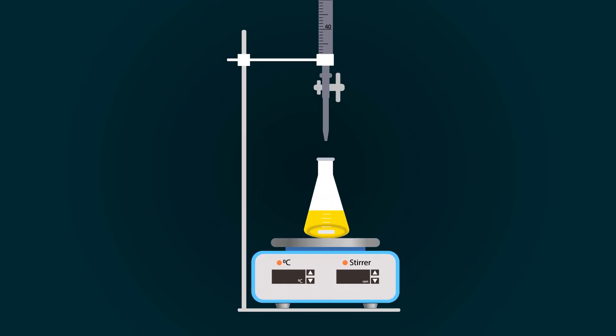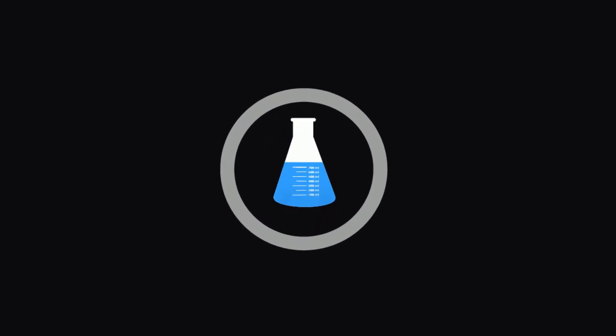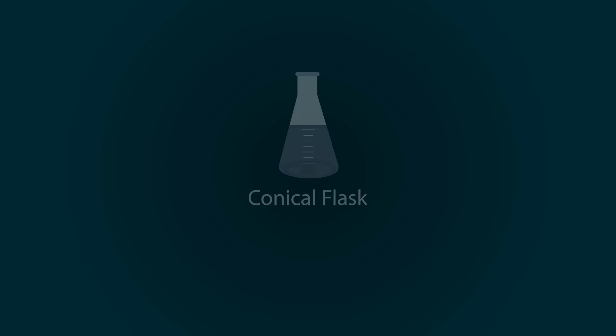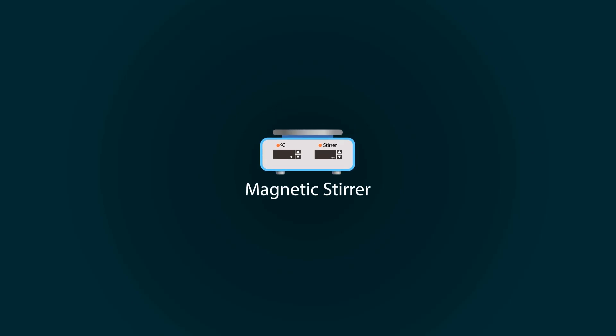In this video, you will learn how to titrate sodium carbonate against hydrochloric acid. You will need an iron stand, 50-milliliter burette, funnel, 0.1 molar solution of HCl, magnetic stirrer, magnetic bar, and a dropper.